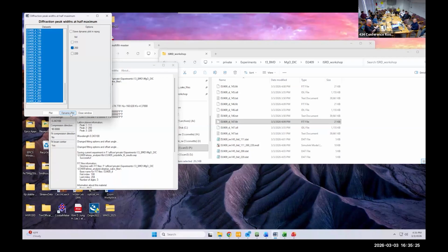Do you mean just so people can see the D-DIA, where the handles go and stuff? Or pull it out and see the experiment they just did? Oh, I see. Yeah, it's decompressed, so it should be at room pressure now. We could take the whole thing.